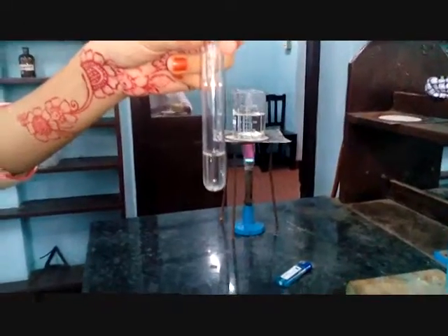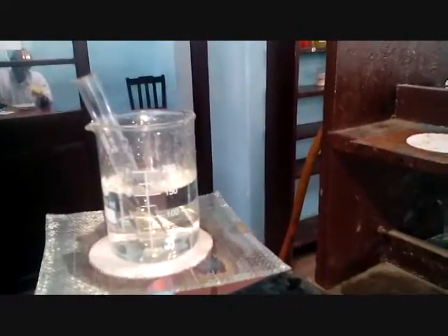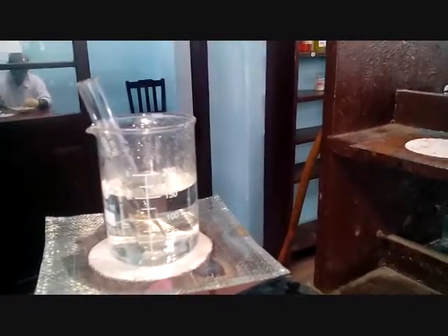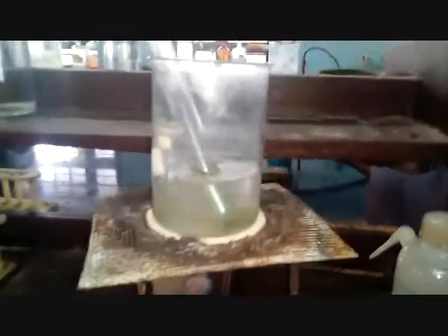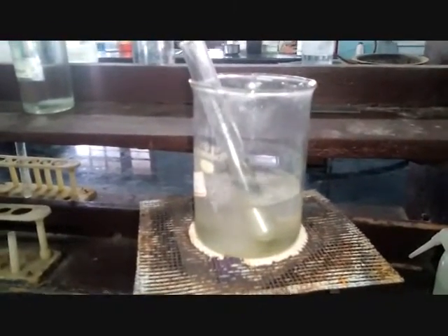Tollens' test. To about 2 ml of the Tollens' reagent, add a little of the compound, and then heat on a boiling water bath for a few minutes. A black precipitate is first formed and then a bright silver mirror. The compound may be an aldehyde or a reducing sugar.